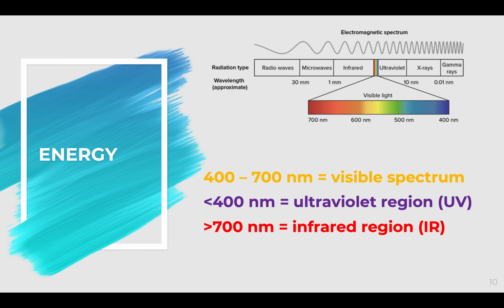I hope you are still with me. Again, it's very important for us to know the frequency and the wavelength, because as we go deeper into the spectrophotometer, we're not simply measuring the light.